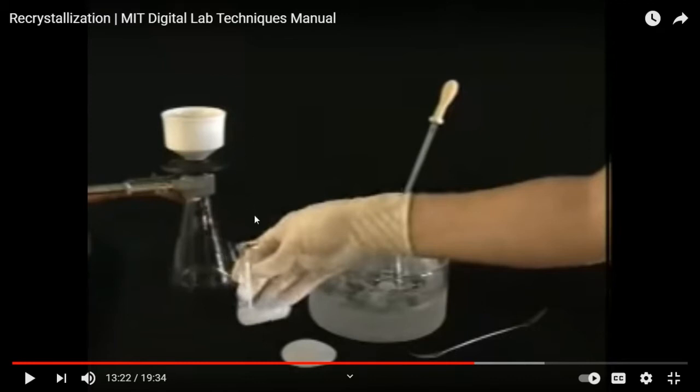Then when do you use this filtration? When we keep the solid as our main compound. Then it doesn't matter if you lose liquid or not. And then you want to lose liquid as soon as possible because you got the maximum solid out of liquid by cooling.